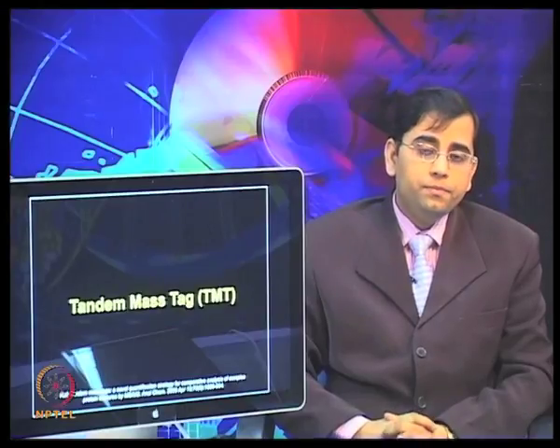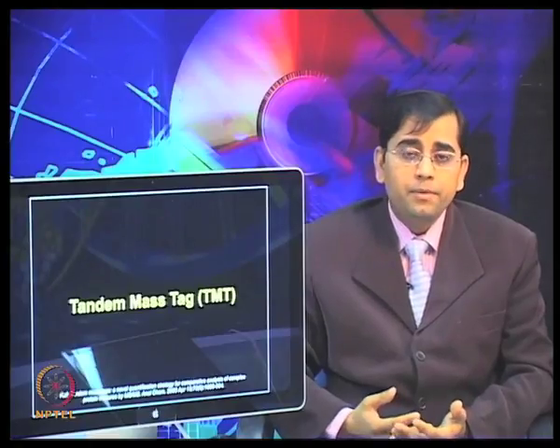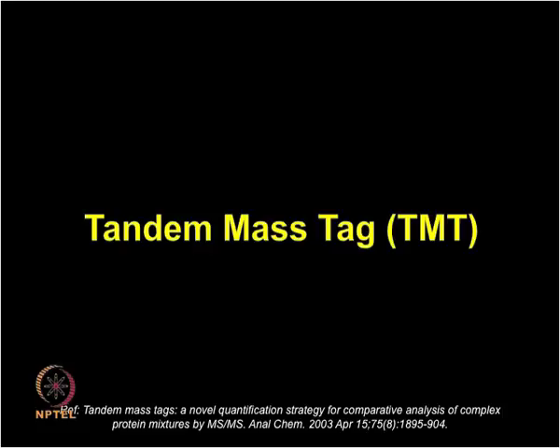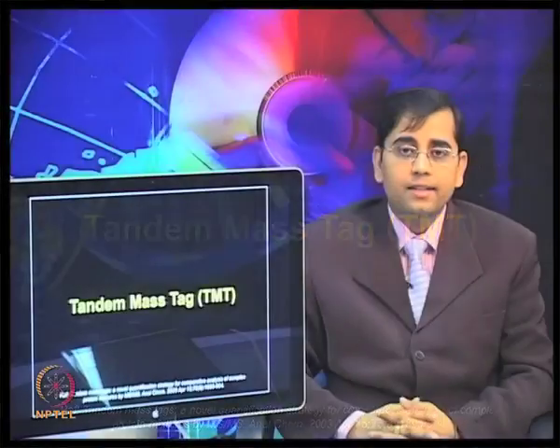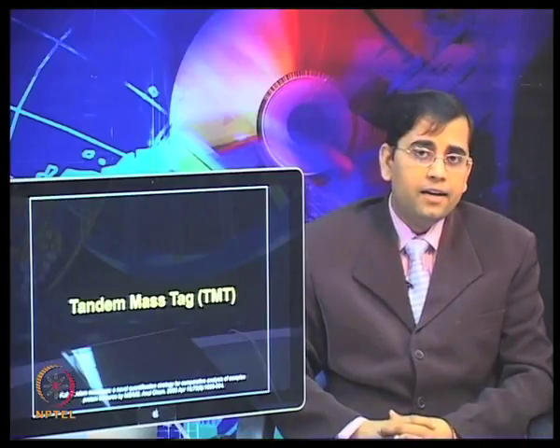Now, let us talk about tandem mass tag or TMT. This method is similar to the iTRAQ which we just discussed. TMT is also an MS-based quantitative technique which uses isotopomer labels referred to as tandem mass tags. It also provides accurate quantification of peptides and proteins. The tandem mass tags have been developed by Proteome Sciences and are currently commercialized by Thermo Fisher.